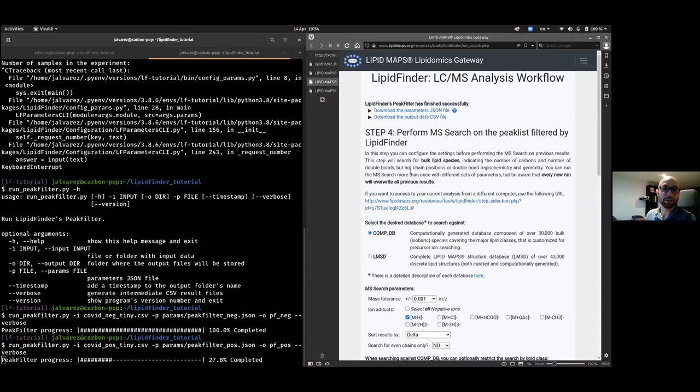Yeah. I mean, it's another one which some people might find useful, but other people might not like that approach anyway. It's where we combine positive and negative data sets, taking into account the changes in mass between lipids that ionize in both modes. We try and clean it up like this, but I think the last experiments we've done, we haven't used it. We've looked at positive and negative separately. So as long as people know they can try that if they want, but it's an option, I guess, to download already as positive or negative and do LMSD bulk searches, isn't it? Yeah. Individually anyway.